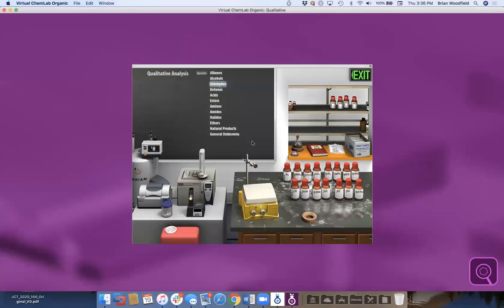All right, so these are just PDFs. Again, what you could do is open the ones you want and save them externally and deliver them in your LMS system, or just have them grab it from the client, doesn't matter. Or we can share the Word files with you if you want to edit and change in any way you want. Yeah, we'd be glad to do that. All right, any questions about organic?